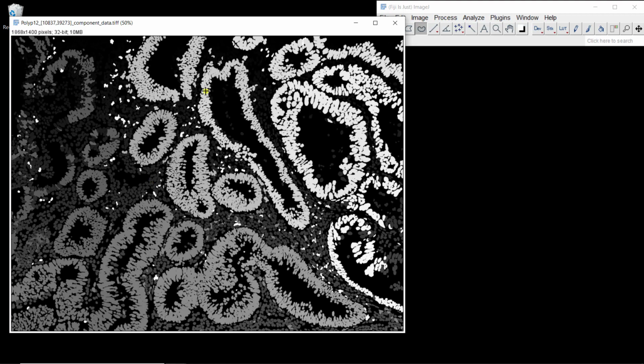Separating nuclei is really a tough task. As you can see, we have a very high density of touching nuclei. So we can use 3 different classes: one for background, one for inside nuclei, and one for nuclei contours. So that's what we're going to do.